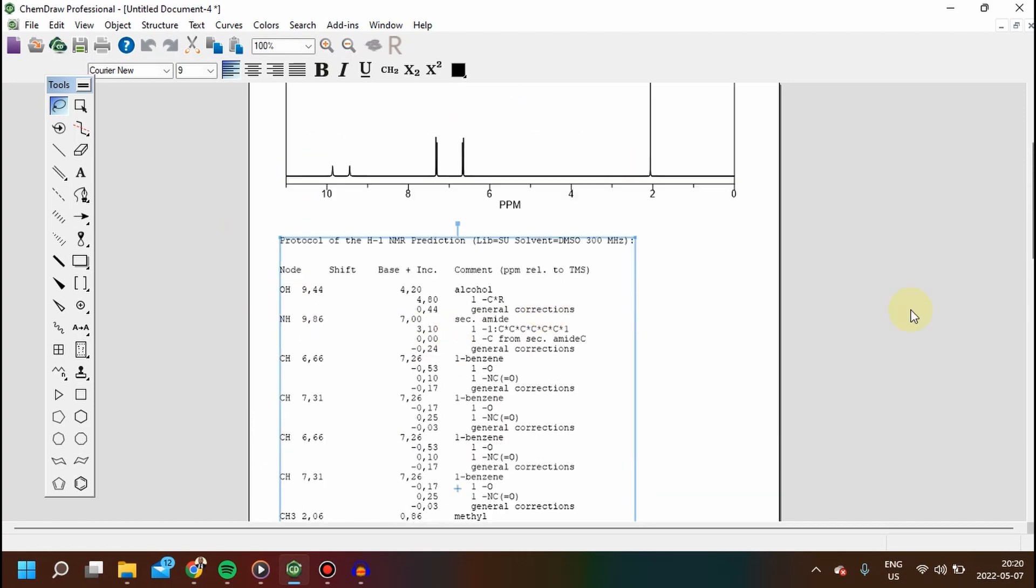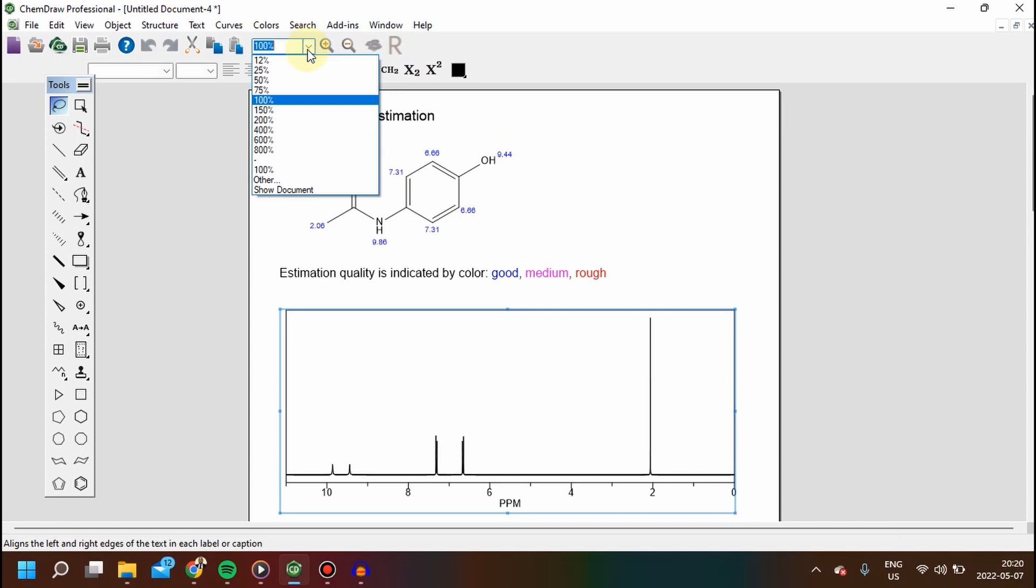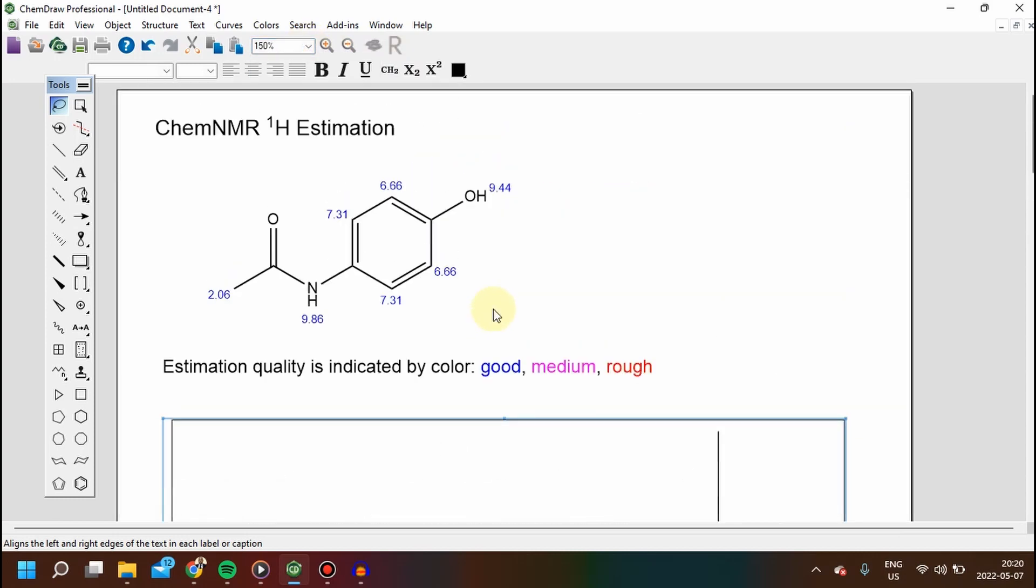From the compound, for example, we have the proton NMR chemical shift for the OH proton occurring at 9.44. This is in agreement with what we expect to be highly downfield shifted because the oxygen is highly electronegative, so it draws electrons from the proton.